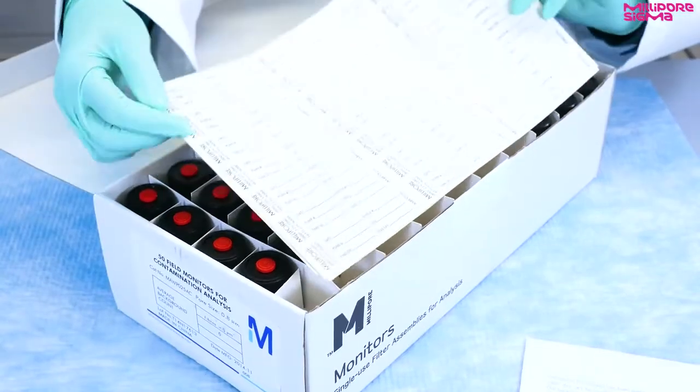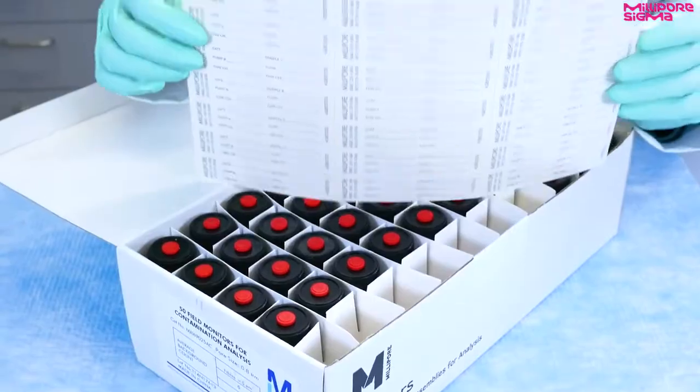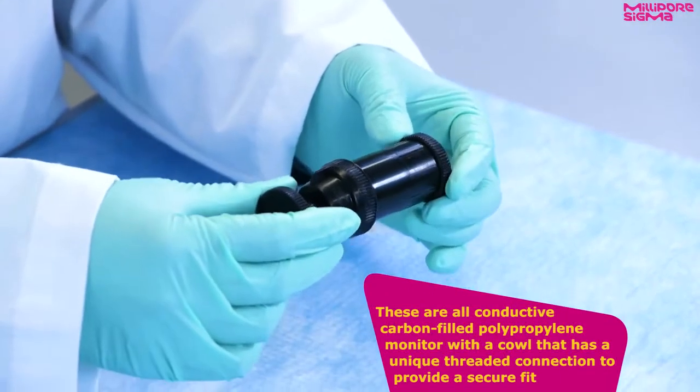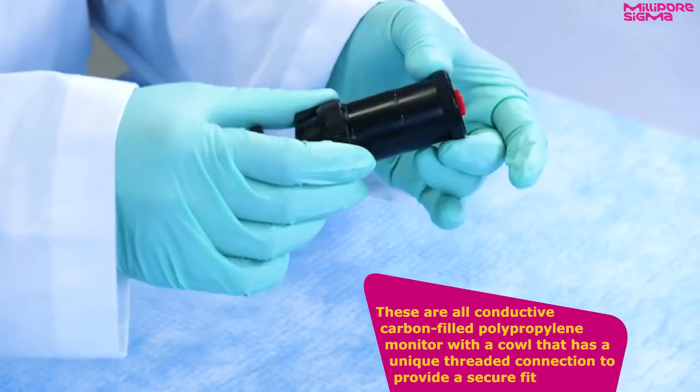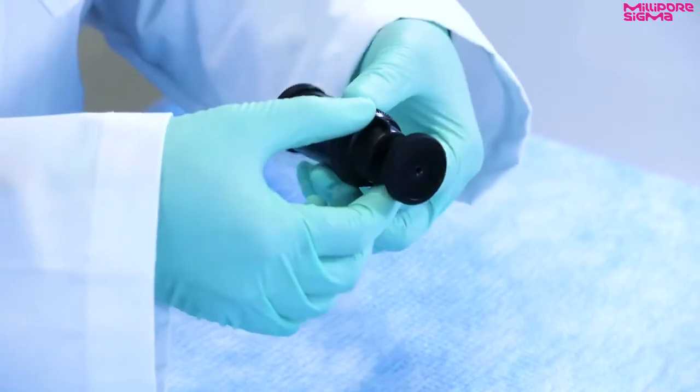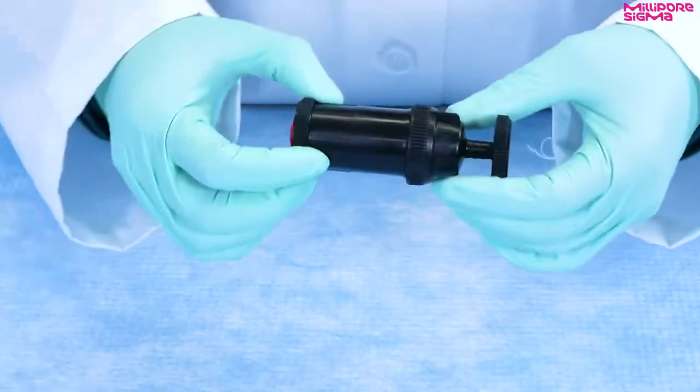Each box contains pre-printed labels for each cassette. These are all conductive carbon-filled polypropylene monitors. Each monitor has a cowl with a unique threaded connection to provide a secure fit. These monitors minimize static electricity and help ensure uniform particle or fiber distribution.